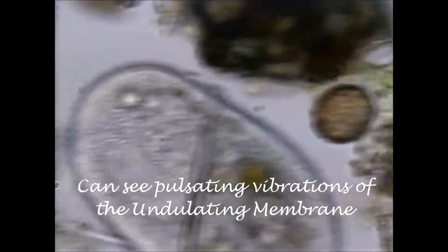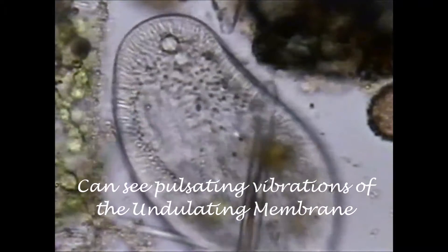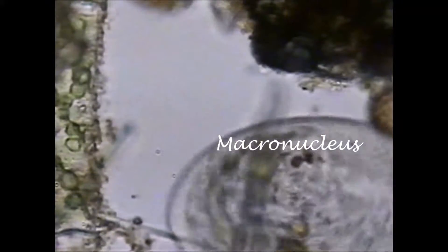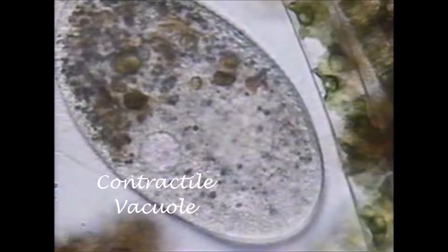Food is swept into the cell by these structures. A macronucleus can barely be seen. It does have a micronucleus which is not visible. A single contractile vacuole can be seen expelling excess water from the cell.